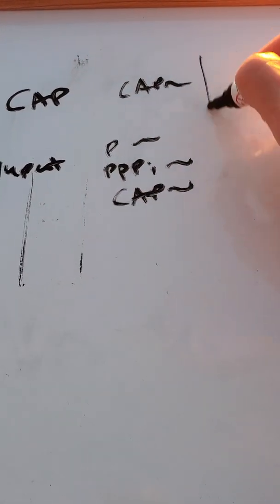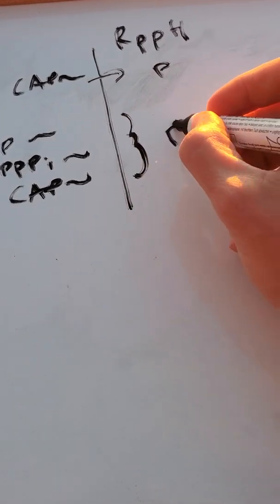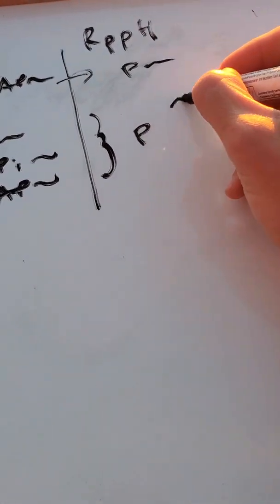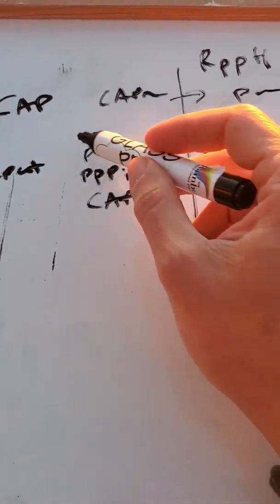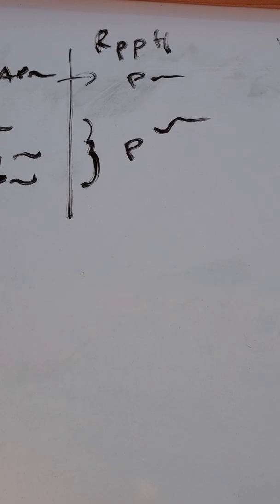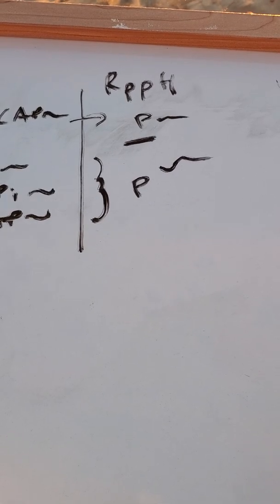And the first thing we're going to do to all samples is we use this pyrophosphatase called RPPH, which makes everything monophosphorylated, whether cap, triphosphate or diphosphate. And of course, what's monophosphate will just stay monophosphate. We do this because you actually need 5' monophosphate for the adapter ligation on the 5' end.